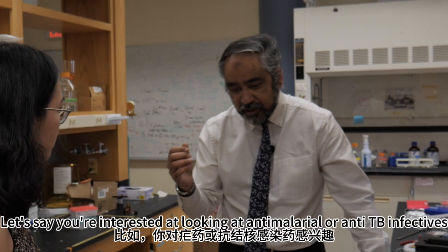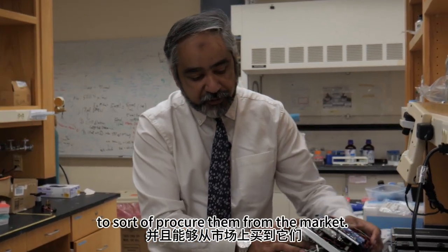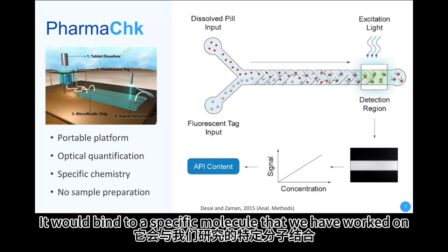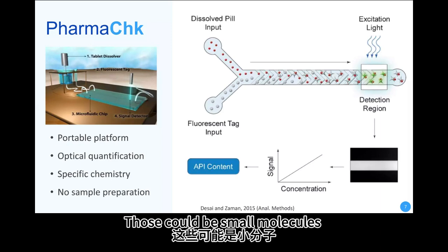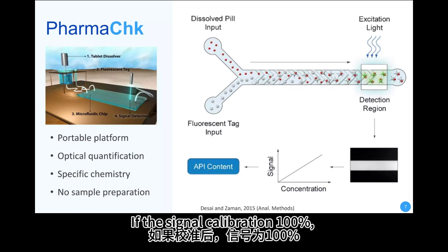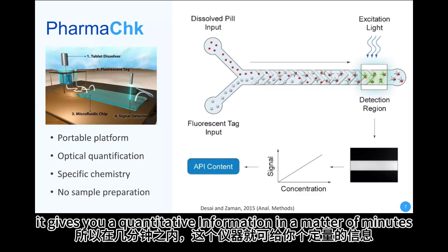And let's say you are interested in looking at antimalarials or anti-TB infectives and are able to procure them from the market, and you want to see what the quality of those is. So you would put the drug, and it would bind to a specific molecule that we have worked on. Those could be small DNA snippets, those could be small molecules. Upon the reaction, they'll give off a signal, and the signal is proportional to the concentration of the active ingredient. So if the signal calibrates to 100%, then the drug has 100% of the active ingredient. If the signal responds to 35%, so it gives you quantitative information in a matter of minutes.